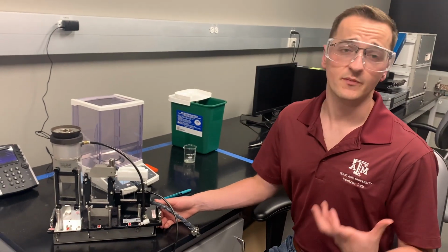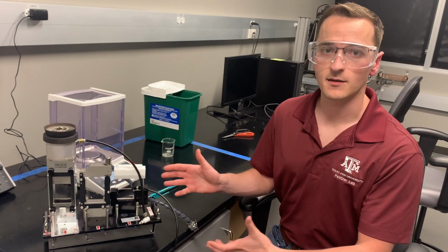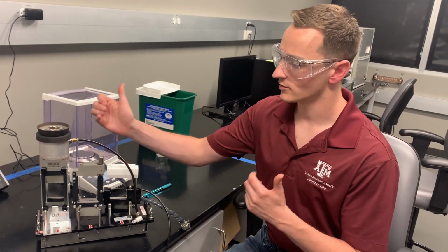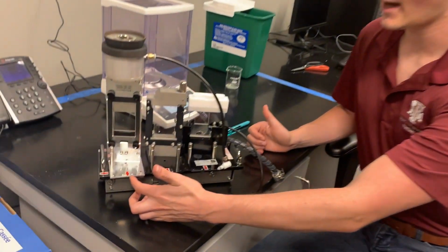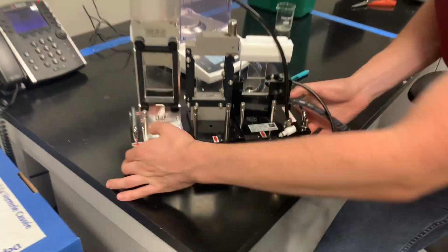One of the interesting features about this instrument is that the cassette is removable. So when placing it back into the instrument, depending on the method that you're using, whether it's the dry cell, the liquid cell, or the fraction cell, you'll align the arrow with the path of the laser inside of the instrument.